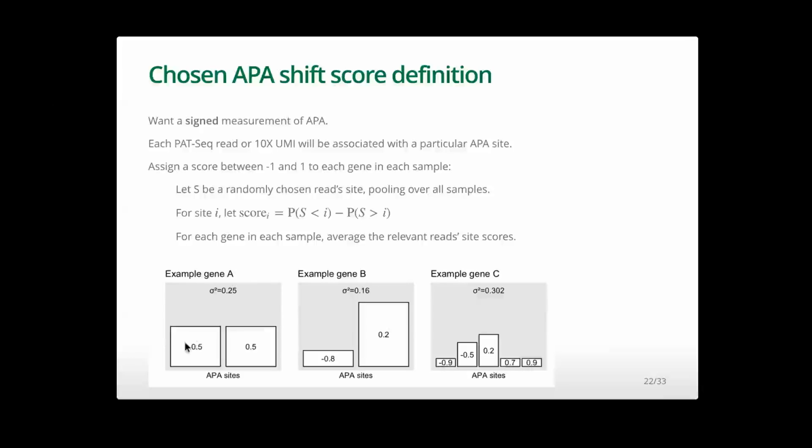So upstrand sites will generally get a negative score, downstrand will have positive scores. If you were to average this over all reads, the average would be 0. So it's a little bit complicated, but it lets us cope with a funny situation with a bunch of sites, and we can get some sort of quantification of that. If we limited ourselves to looking at 2 sites, we could come up with various other things.